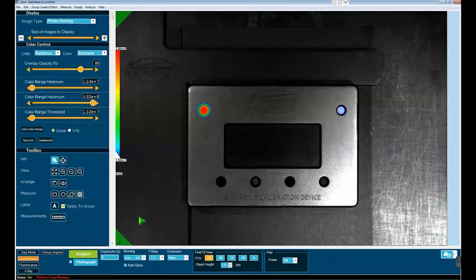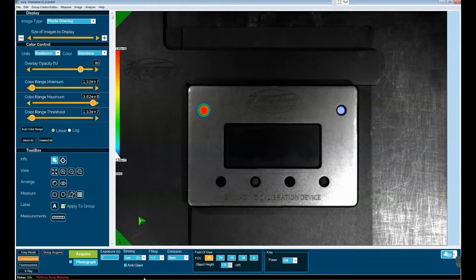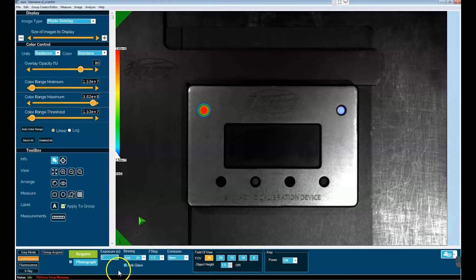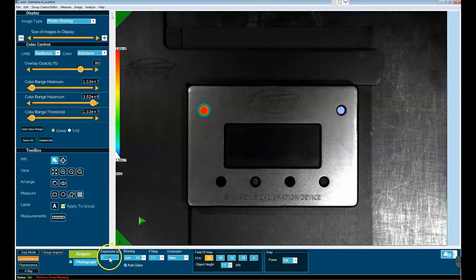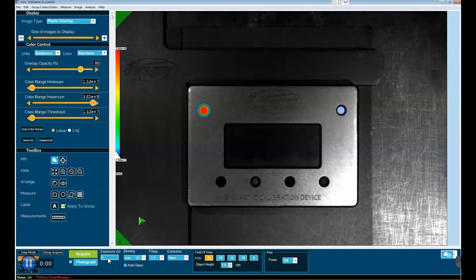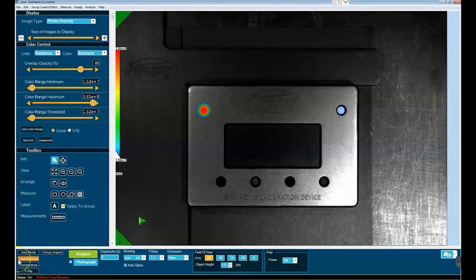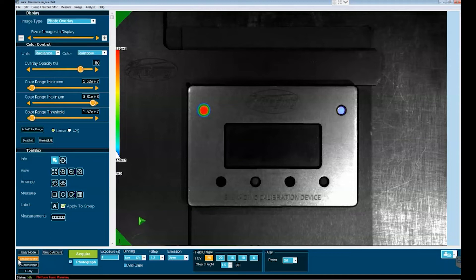Now that you've seen how straightforward it is to take a luminescent image, I'd like to take a brief moment and walk through the various different camera settings that are listed down here in the camera ribbon for luminescence and explain the options that you have available to you. First of all is exposure - you can enter in an exposure time in terms of seconds, and typically this will be anywhere from 1 to 30 seconds. If you happen to have a target with a relatively low intensity luminescent signal coming from it, this time can go to as long as 300 seconds or five minutes.